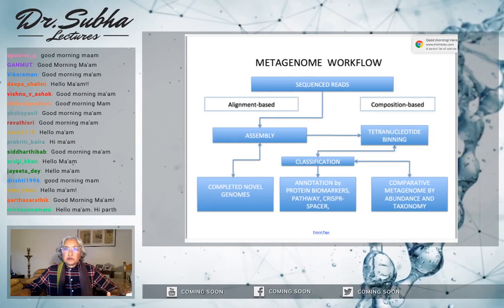Also, what else we did was we know how we can sequence really small fragments, 300 base pair fragments, and sequence a large number of them, so we can assemble them and come to know what is there in the metagenome that we sequenced, which organisms were there, and how to characterize them. So I'm going to switch to the PDF mode right now, PowerPoint mode.